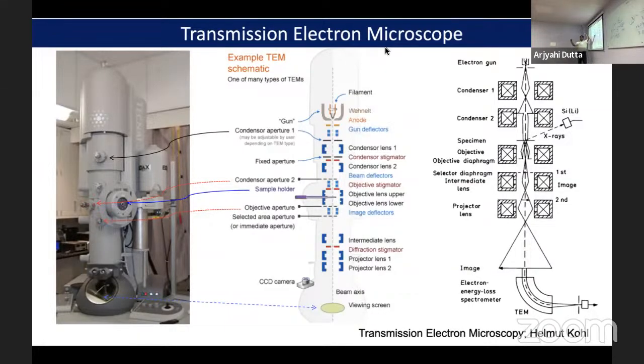So here, in any light microscope, I have one small question. Here we are talking about the electron microscope, and we have a multiple lens system. If you just go here: condenser lens 1, condenser lens 2, then objective lens, intermediate lens, and projector lens. And that is giving us the image, a very magnified image. So it is very simple if we don't think too much.